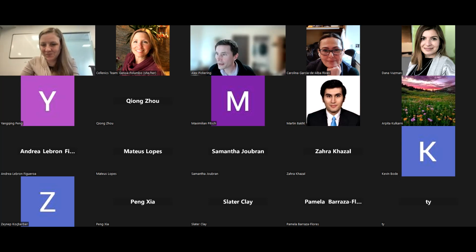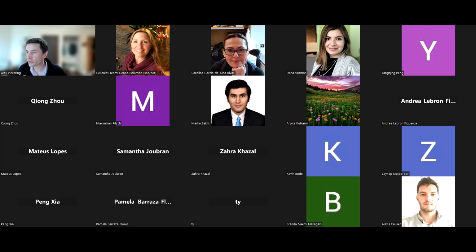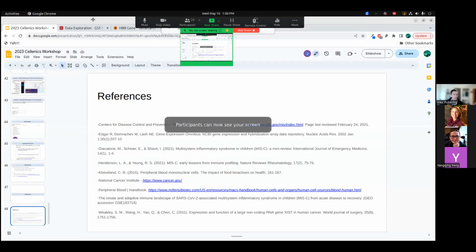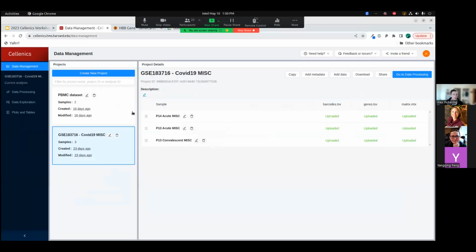Yeah. So Yang King is asking, is there a way to export intermediate data after done with a data processing step? For example, to get the cluster information. So great question. Unfortunately, it's not as good as I would like it to be, but it's something that will be updated soon. You can export your data by going to data management and clicking this download button, and you can download the processed Seurat object. So that's after data processing.